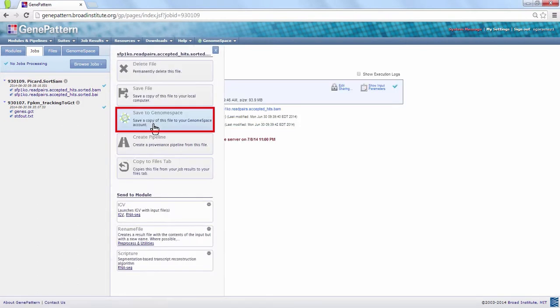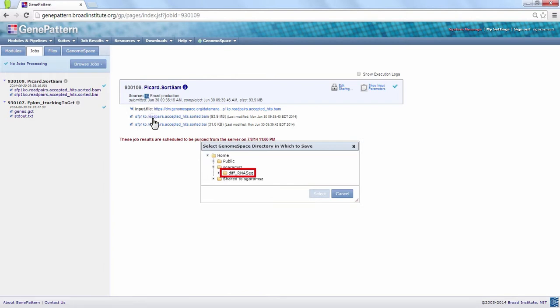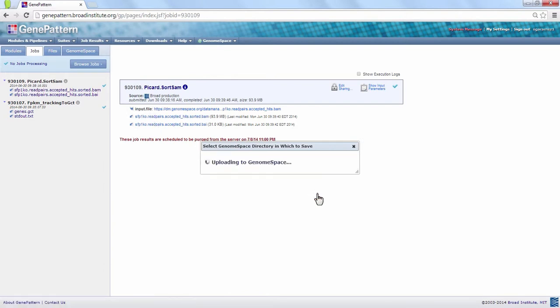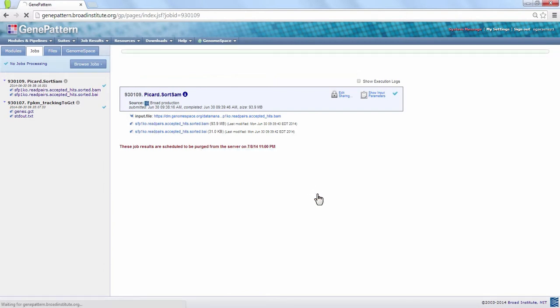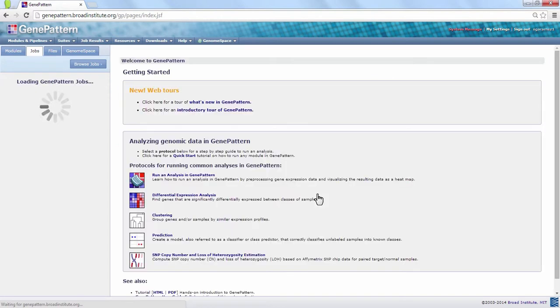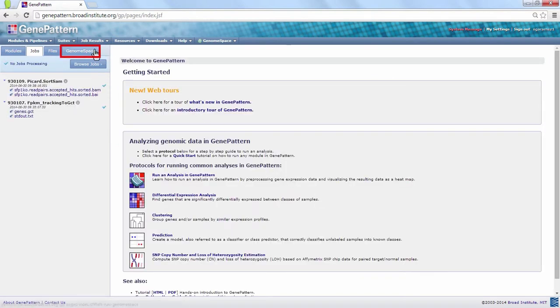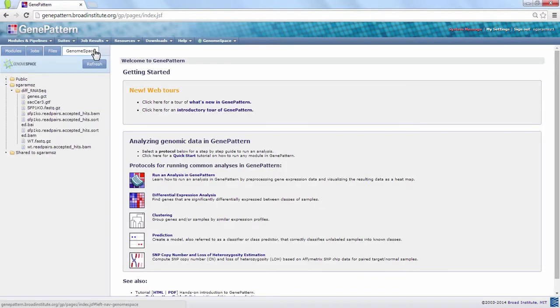The BAI file is an index that sorts the sequence alignment data in the BAM file by position. Click the GenomeSpace tab to see those files.